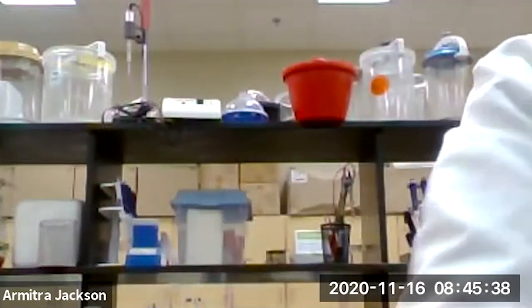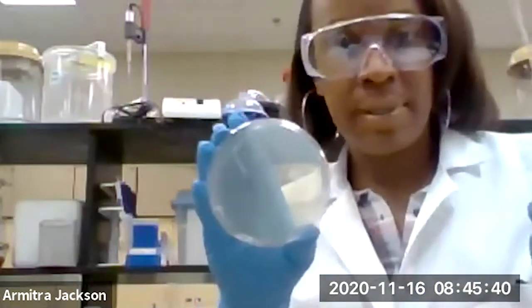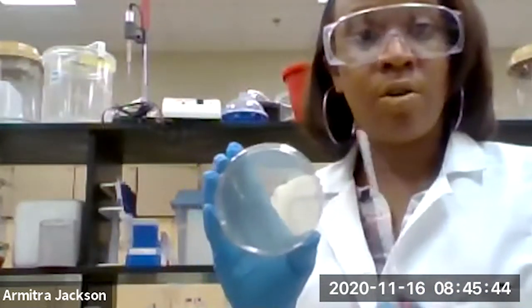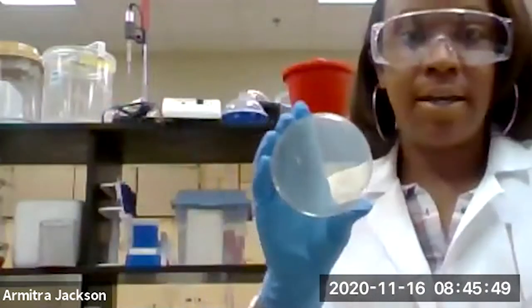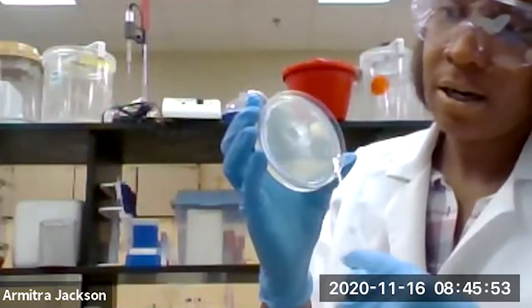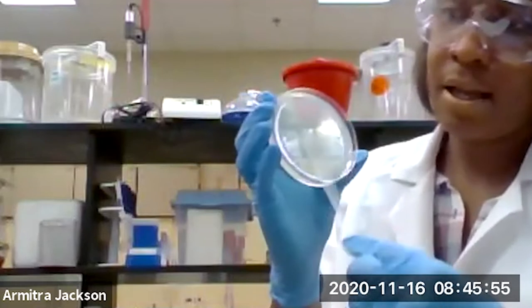We're on SPC media and we won't be using the quadrant method — we're going to be using the zigzag method this time. So you take your petri dish and you just swab it like that.